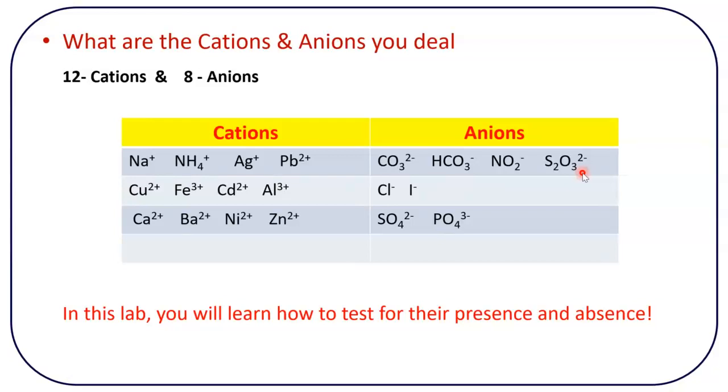The second group came from a stronger acid than the previous group, and it is called the concentrated sulfuric acid group. It contains chloride, iodide, fluoride, nitrate, but we're going to discuss just two of them, chloride and iodide. The group reagent is concentrated sulfuric acid.